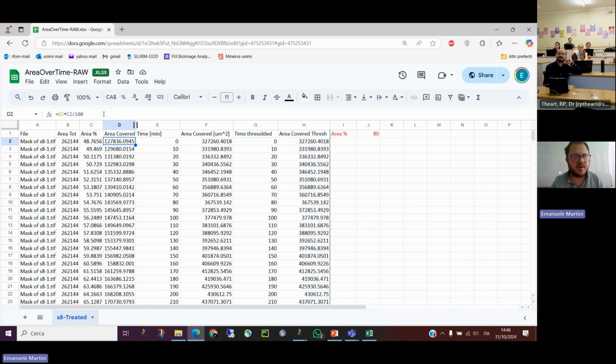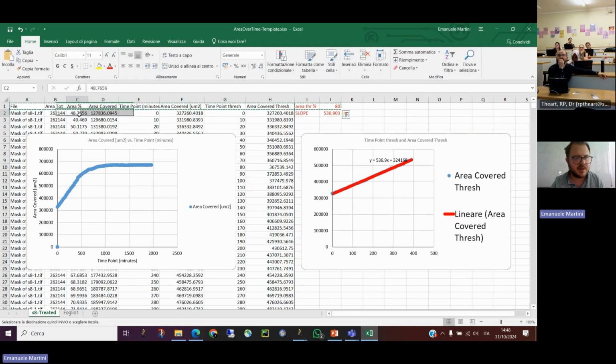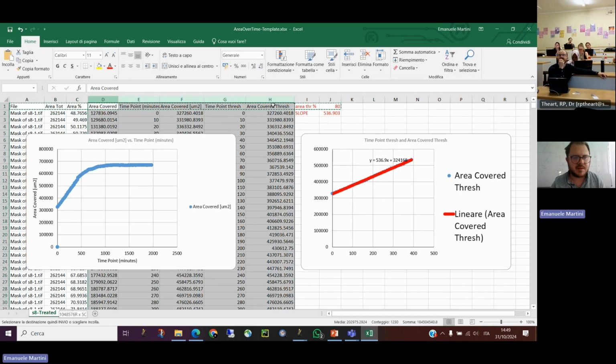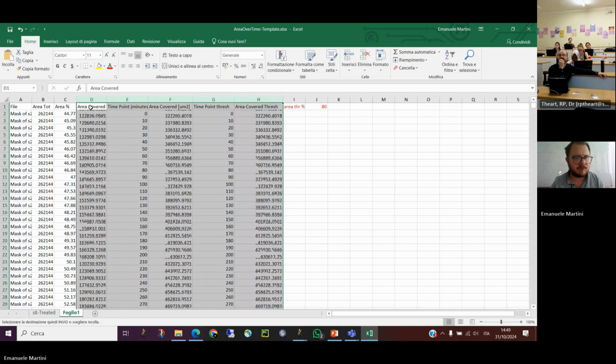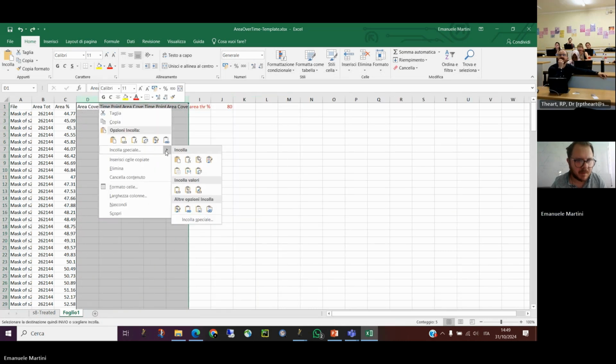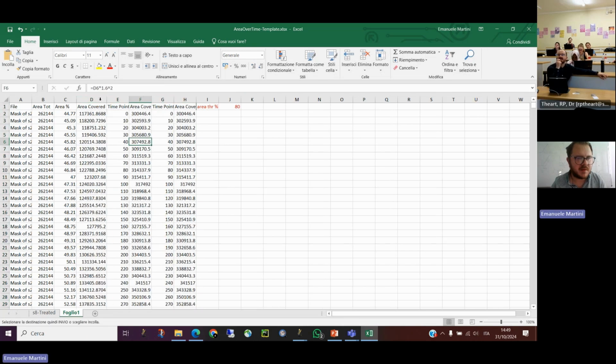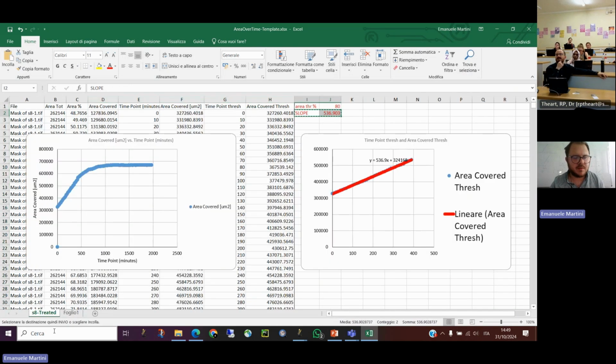You can copy all these formulas, and then you copy your new data, and it should work. Now we see if it's true or not. Let's see if it works, so I have to do something more. Let me see if it has worked out. Yeah. So now you have that, and then you can also take this one, the slope.